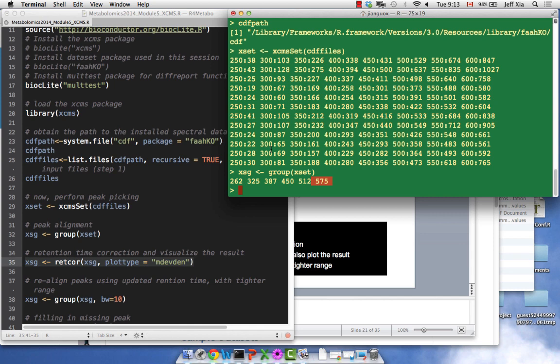So we do not get any information from the number, right? No, we do get the information. This is how many groups we get. It just tells you we have about 600. We're going to visualize that later. This is just a summary. Oh, this is the group number it detected. Okay. Yeah.